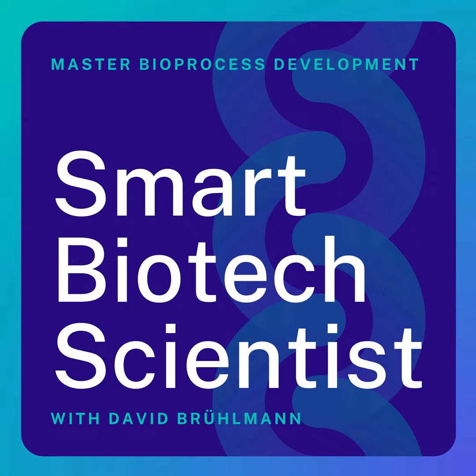Let's smarten up biotech. How do we manage these huge quantities? Because there is also an operational side of the thing. We have to produce all that media and store it somehow. Are there any smart strategies out there? Oh, absolutely. That's one of the major headaches. And if you look at facility designs, if you've compared some plants in the past, you can tell if a facility from a top-down point of view is based on fed-batch or based on perfusion, because you need a huge tank farm if you want to support a perfusion bioreactor.